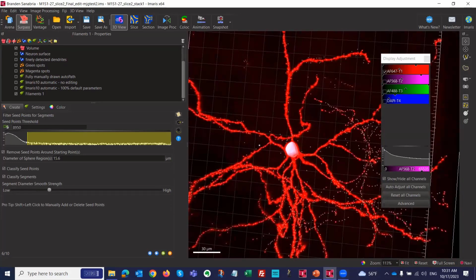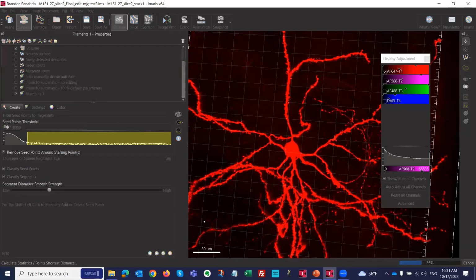So let's go ahead. So now this is step 6 out of 10. The next steps 7 and 8 are both machine learning steps. So if you don't want them, you can turn them off here. And this goes down to 7 steps. But I do want to show, obviously, both of those machine learning steps here. So let's go to the next one, the first machine learning step. And you'll notice it's not instantly here, it's still thinking and progressing. But if you've used the filament tracer before, it's much, much faster.